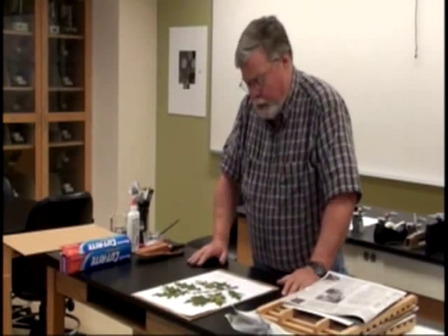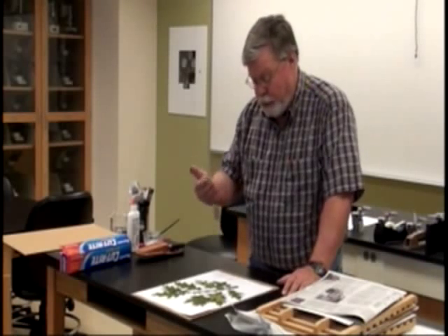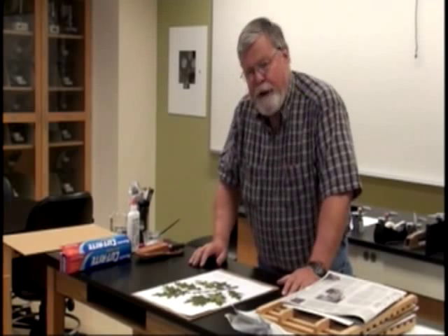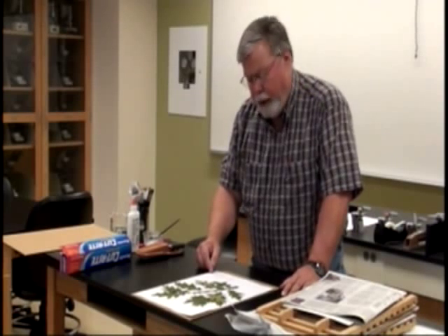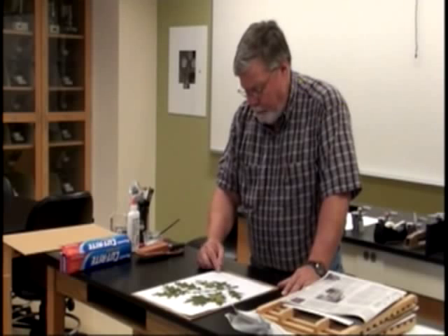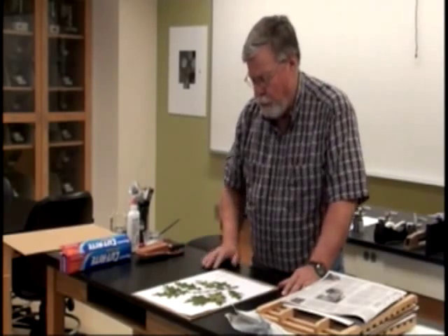We've got a red oak specimen mounted. We've got a label on it giving the common name — red oak — the genus and species, which is Quercus rubra, and the family, which is the Fagaceae family, or the beech family. It also shows where it was collected: the College of Southern Maryland La Plata campus on August 26, 2009, and the collector's name — Lee Vines. That's the information you need on the labels for the plants.